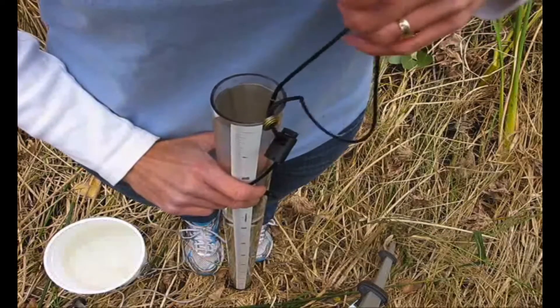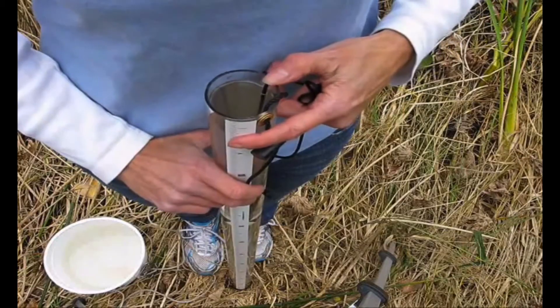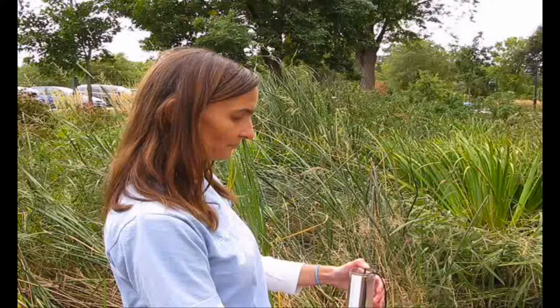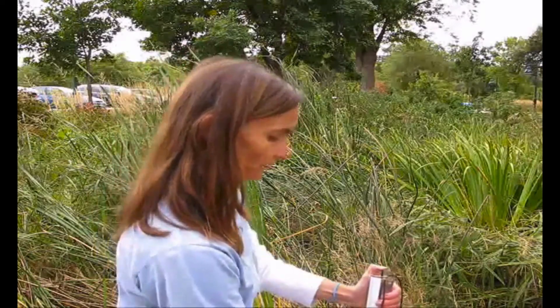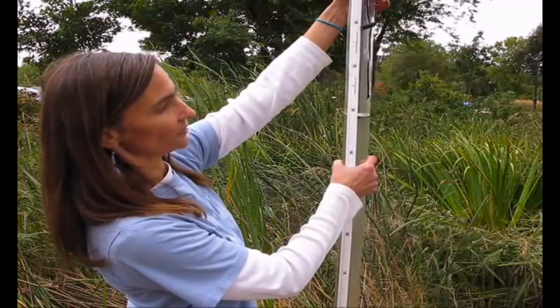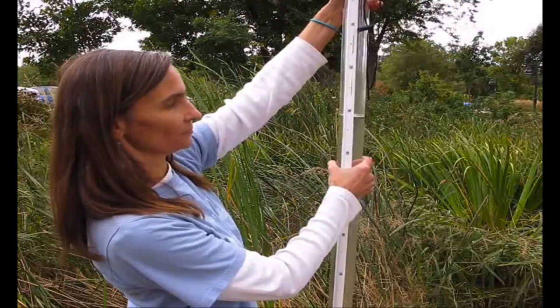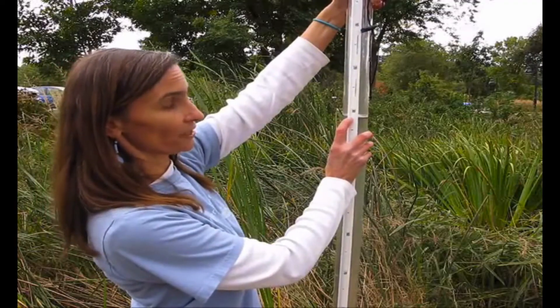Once you've identified the midpoint, pinch the string against the side of the tube with your thumb. Making sure that you hold the string on the side of the tube with your thumb, raise the tube until you can see the disc on the centimeter scale on the side of the tube. This is the reading you'll record on your datasheet.